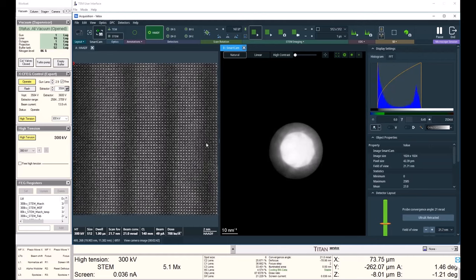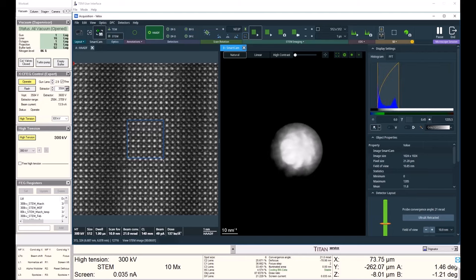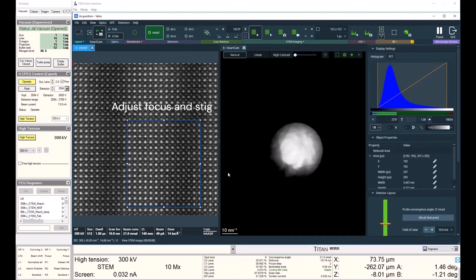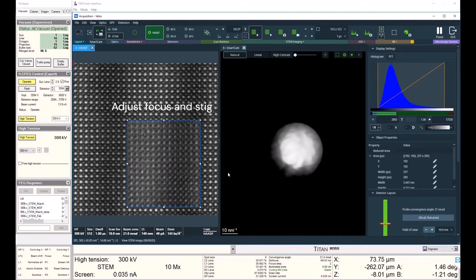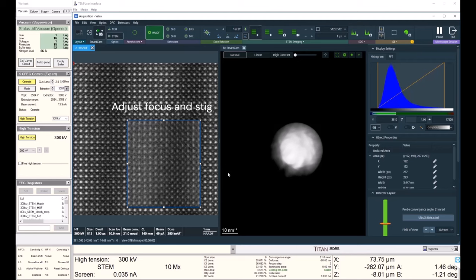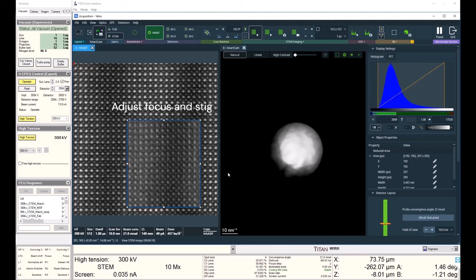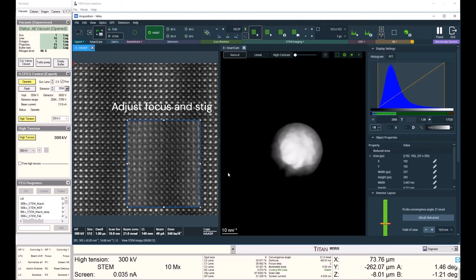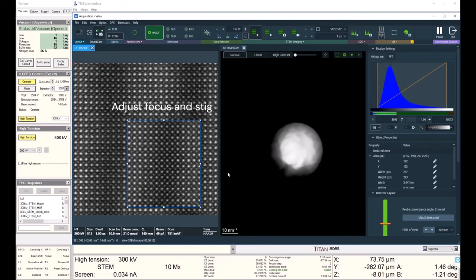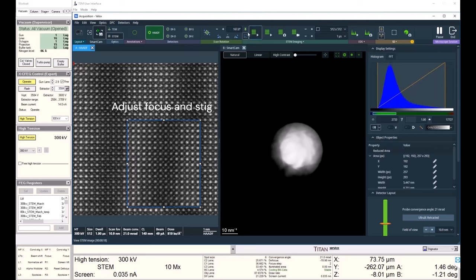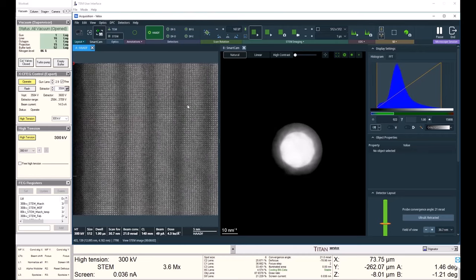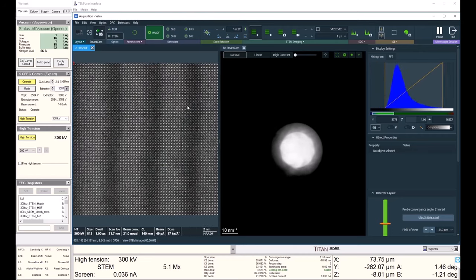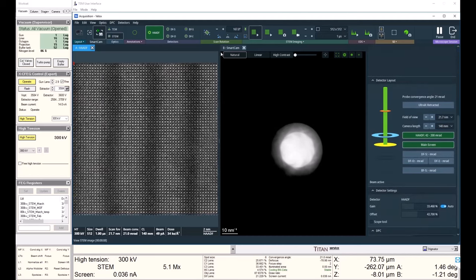And touch up the focus. I want to go in and touch up my condenser stigmator a tiny bit as well. And now that I have my atoms nice and sharp, I'll decrease my field of view to whatever I desire, let's say around 21 nanometers like we have here. Touch up my scan rotation.